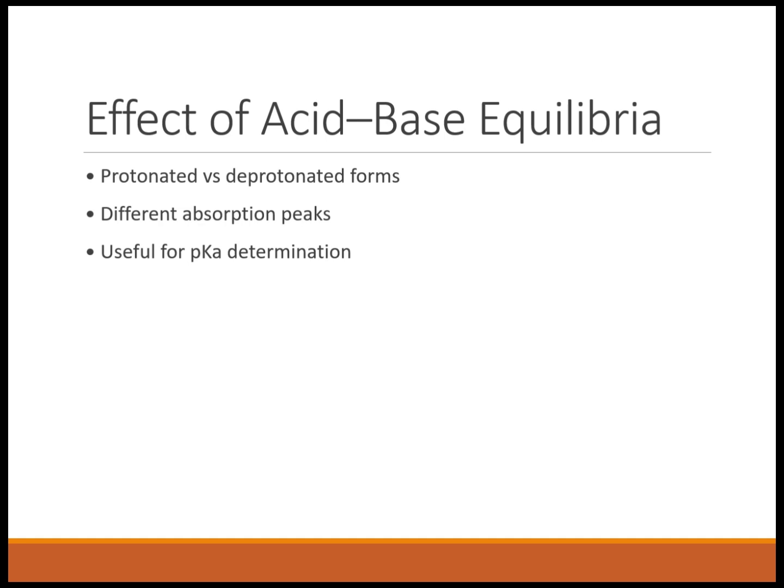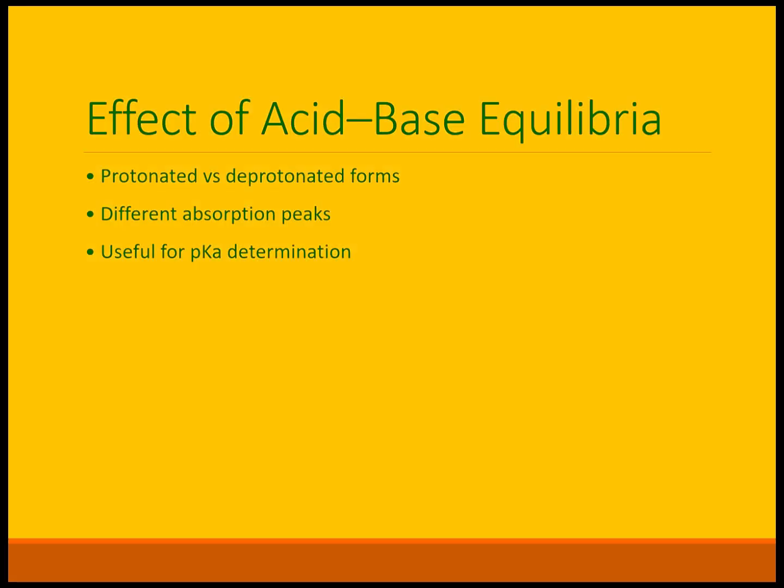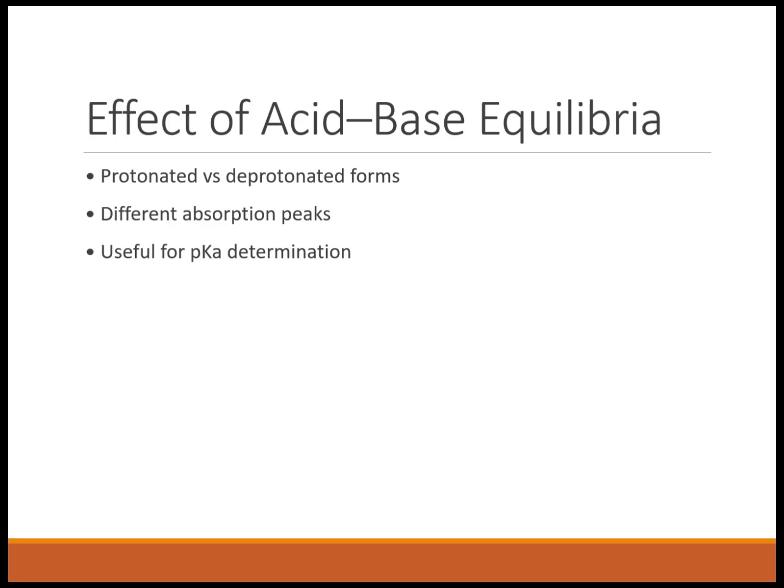Now we will discuss the effects of acid-base equilibria. Acidic, basic and neutral species of the same molecule often have different lambda max values, so UV visible spectroscopy is frequently used to determine pKa values by monitoring these changes. This is especially important in pharmaceuticals and biological molecules.